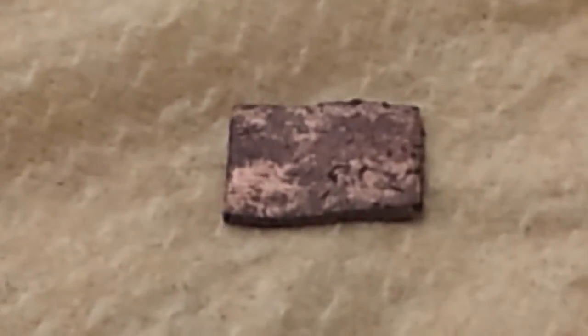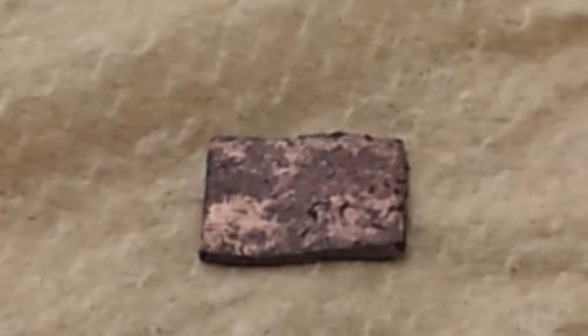Then we have our tin. This one initially showed a bit of a cloudiness. It didn't seem too big at first, but now after being left overnight, it has completely plated itself in copper, and there is no precipitate because it pulled all the copper out and just sort of bound it to itself.